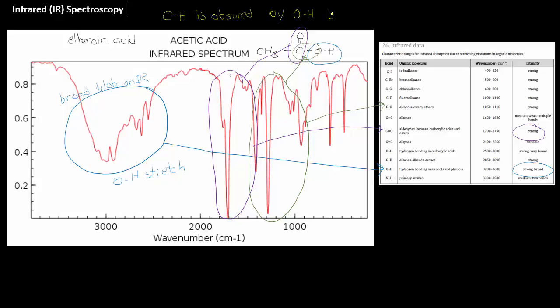One thing I'm also going to note here is that the CH bond that we saw in the earlier example with acetone is obscured by the OH blob. This carbon-hydrogen stretch is often quite strong, but it's very narrow. And as soon as a hydroxyl is present in the molecule in any way, we can no longer see the CH stretch. I would like to note that IR is used to identify functional groups only for our purposes.